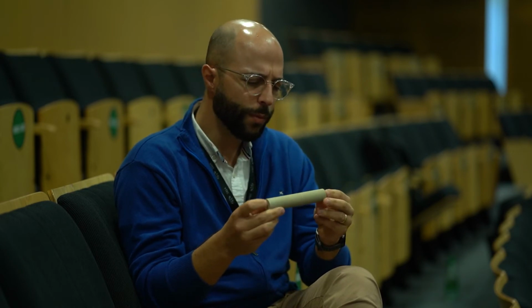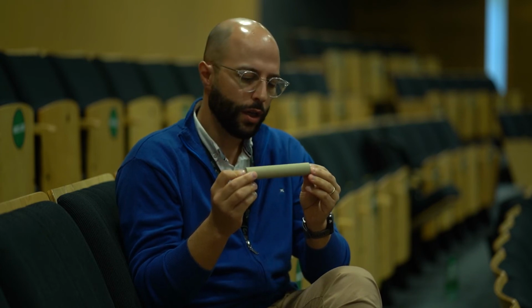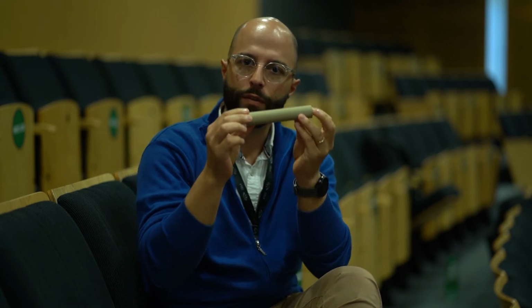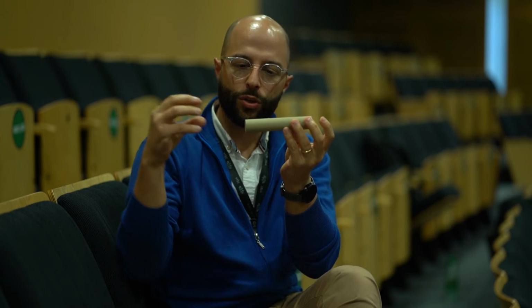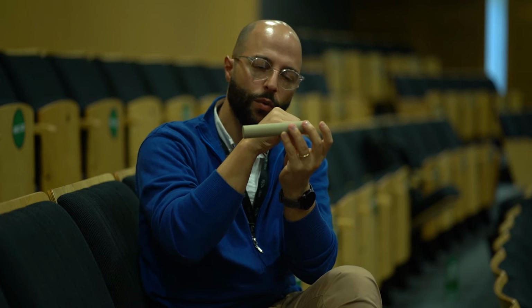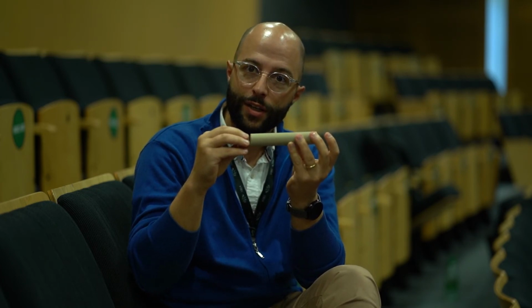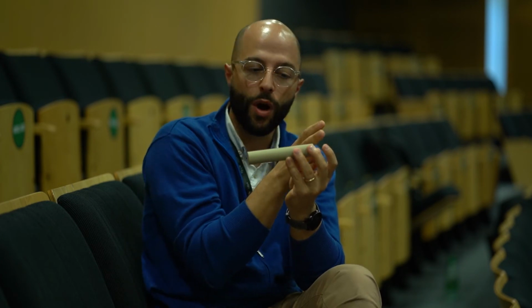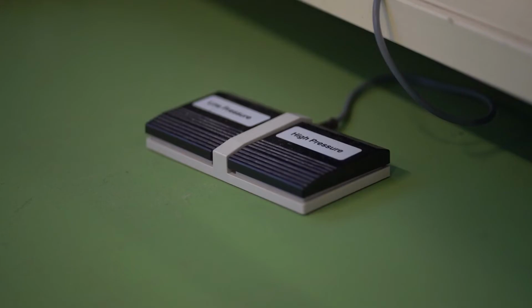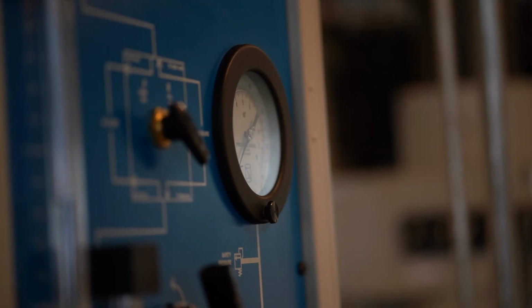So you may want to know how permeable is this rock. So one of the tests you can perform on this rock is you put it inside a kind of a vessel where you push water inside of it from one extreme and you wait for it to flush in the other side. So how much pressure you need in one side in comparison to how much water gets out gives you a quantity that is called permeability. That is the interconnectivity of the pores.